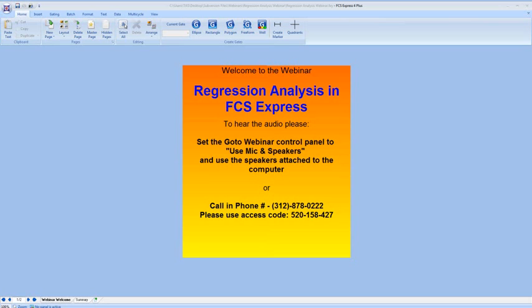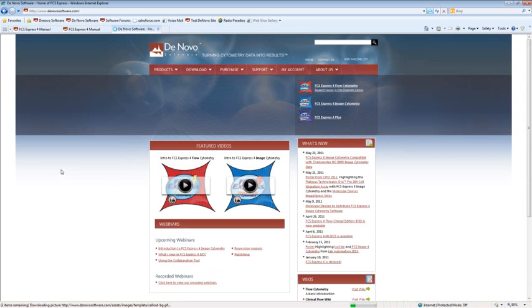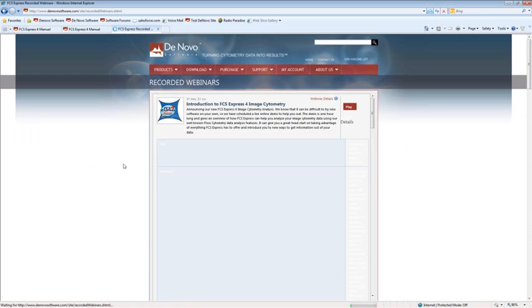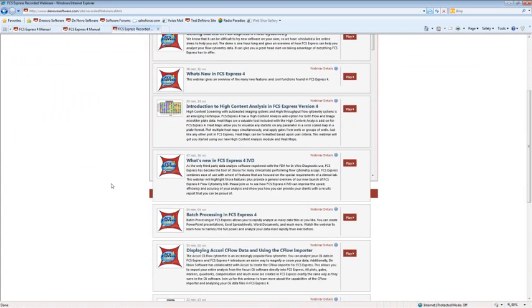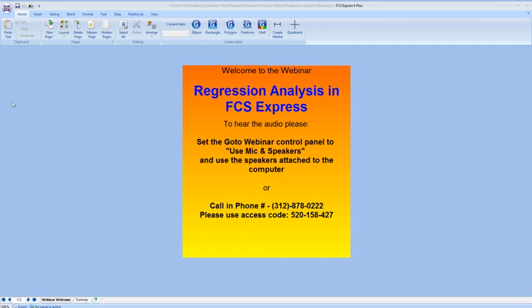If you're not yet familiar with these features, please see our Getting Started in FCS Express and Using Custom Data recorded webinars, that are located on our website. These can be found down here off the main page. There's a lot of resources here for you to get up and running with the software to get you to the point where you can be starting to do regression analysis.